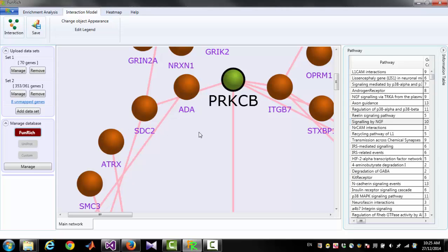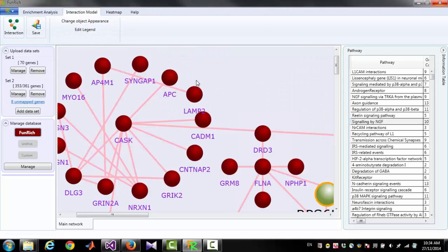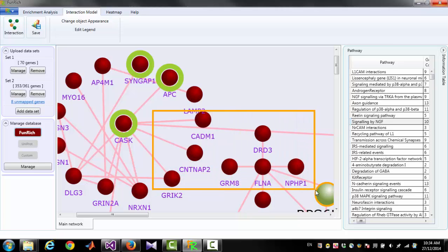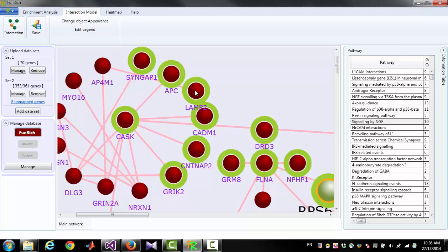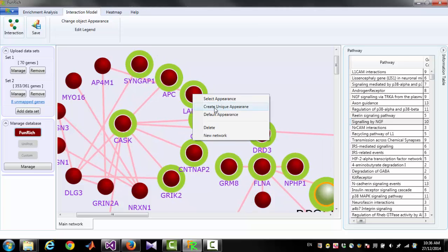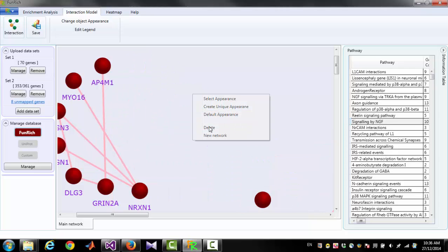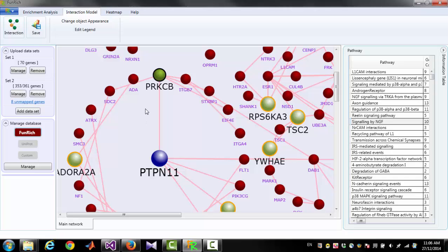You can select one or more nodes by pressing and holding the Ctrl key on the keyboard and clicking individual nodes, or by dragging a rectangle around multiple nodes. After selecting, you can move the nodes, create a unique appearance, select appearance for those nodes, or delete those nodes.